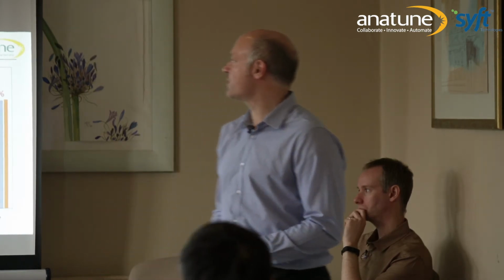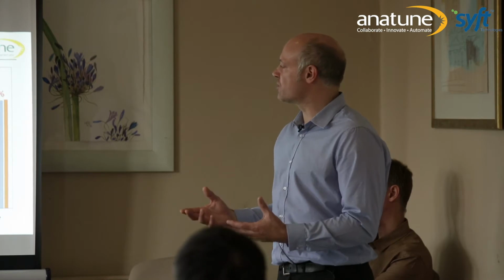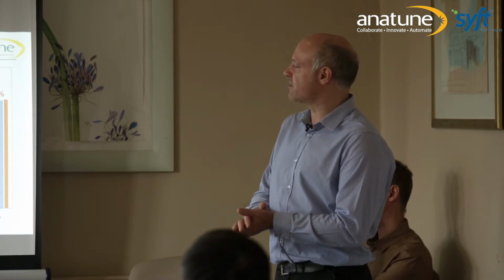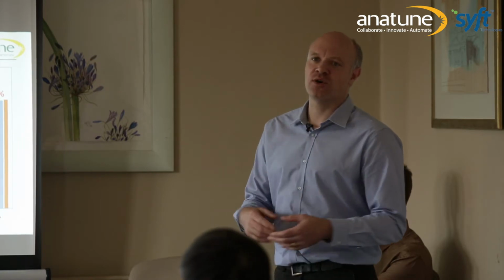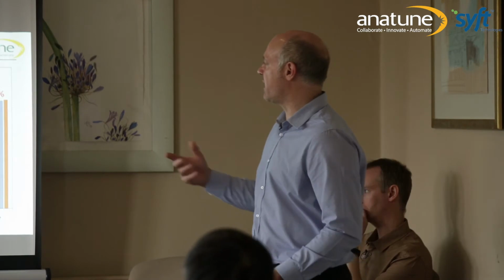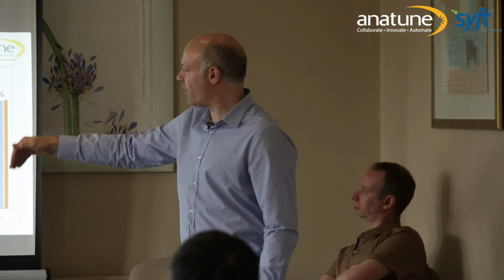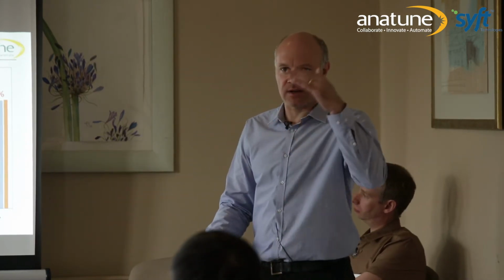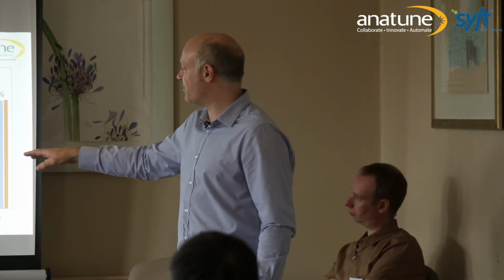Then system precision. In this instance, we produced some repeat standards at, I think it was, 5, 20, 200 and 2000 ppb in solution. We ran the repeats at each concentration and then did the standard precision data for each of the analytes. And you can see here that at the low end concentrations, where we're getting that slight under recovering because of the linearities, the RSDs are fairly poor, but they're okay.